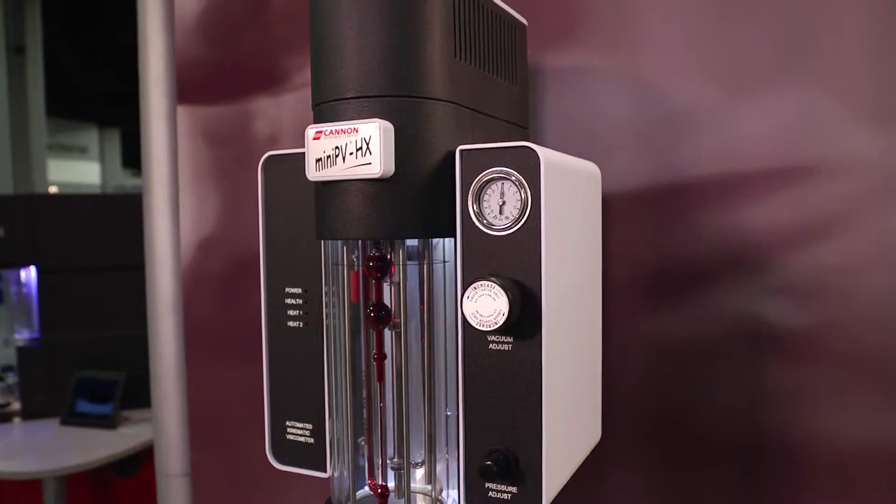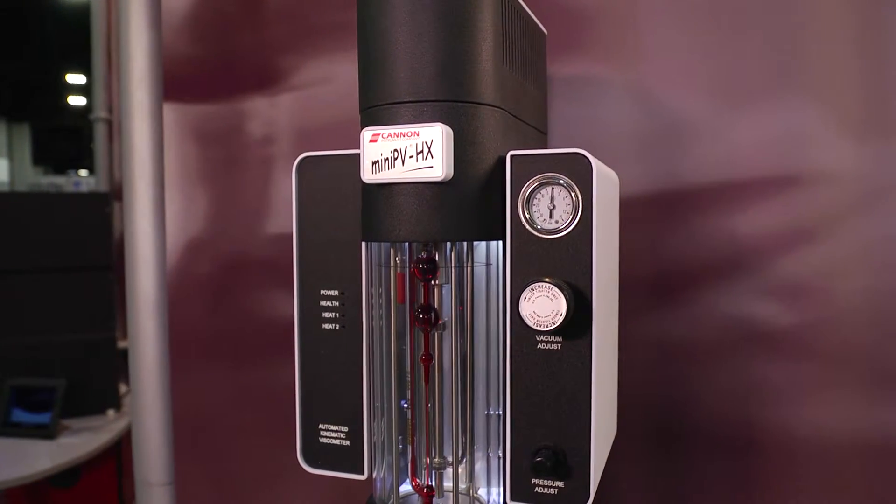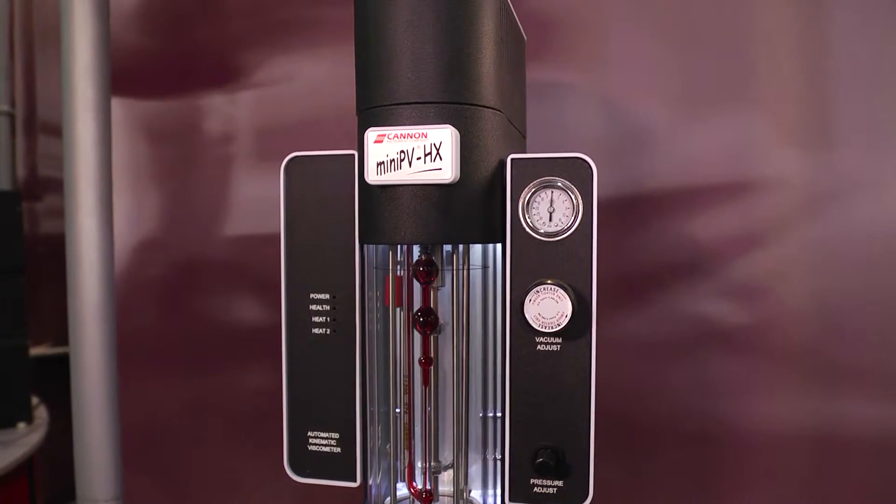Hi, I'm Kimberly Schmidt with Canon Instrument Company and I'm here today to talk about the polymer applications used with the Mini PVHX testing unit. Some of the features of this unit are that it's chemically resistant to the acids and solvents typically used in polymer testing.